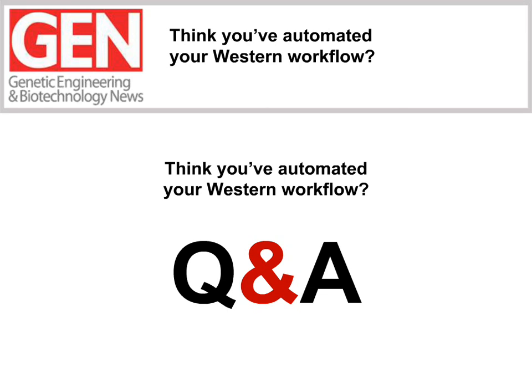Thank you. Andrea, we're back to you again. Do I need to prepare my sample in any special way? So the preparation of the simple Western sample is very similar to what you do with a traditional Western blot. You would add a sample buffer that has denaturing and reducing agents into it. We do provide sample buffers in our kit that you would receive with the plates and cartridges, and it also includes a fluorescent standard that you would add to the sample. But it's a very quick process. I think it's about 5 or 6 steps where you just add the sample buffer, DTT, the fluorescent standards, and then boil, very similar to what you do for a traditional Western.